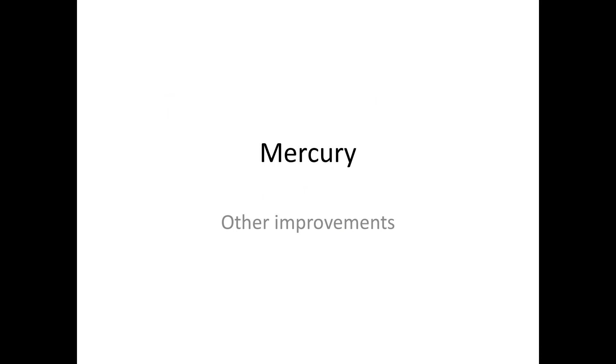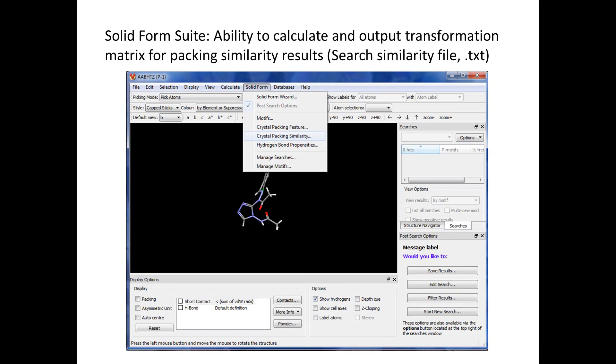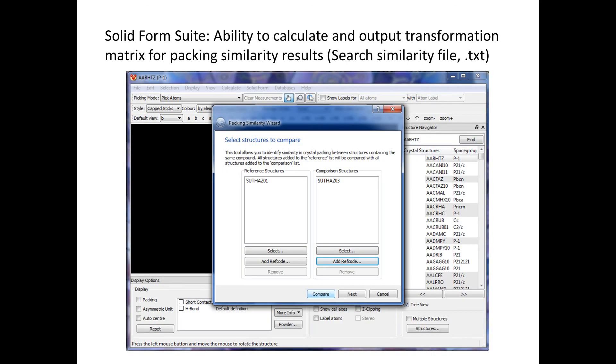There were other improvements in Mercury. One other improvement is regarding the solid form suite. We now have the ability to calculate and output transformation matrices for packing similarity results. To access that, you go to the solid form menu and click on crystal packing similarity, and you compare, let's say, these two structures.